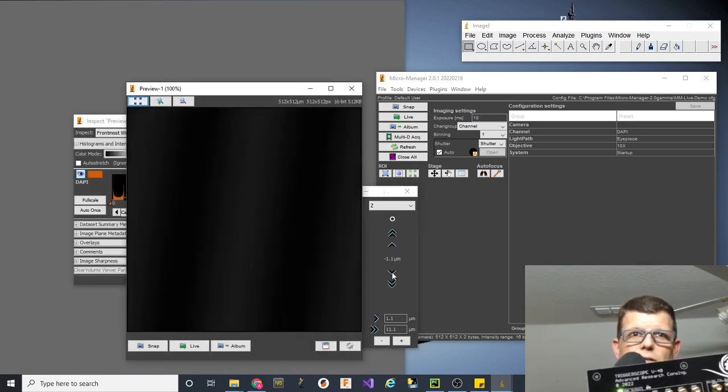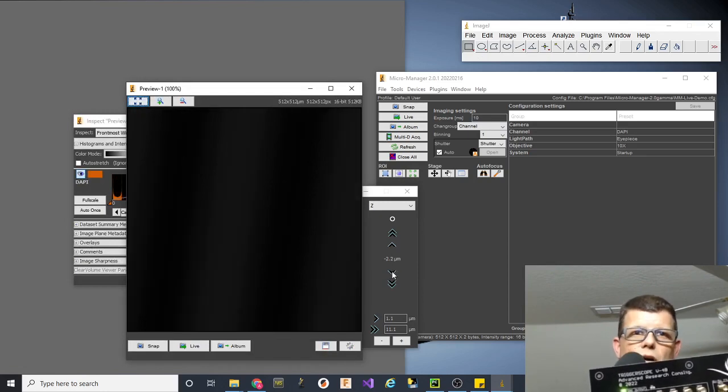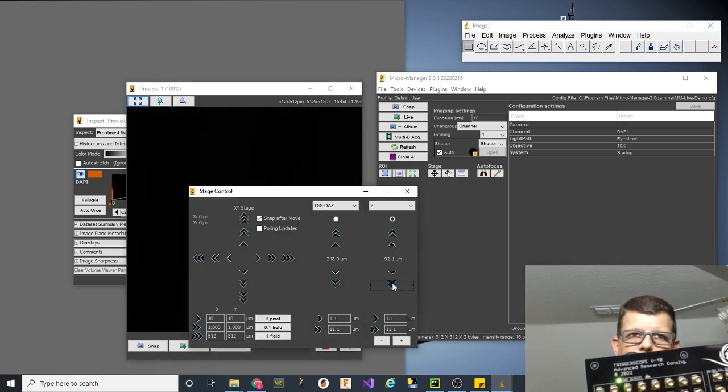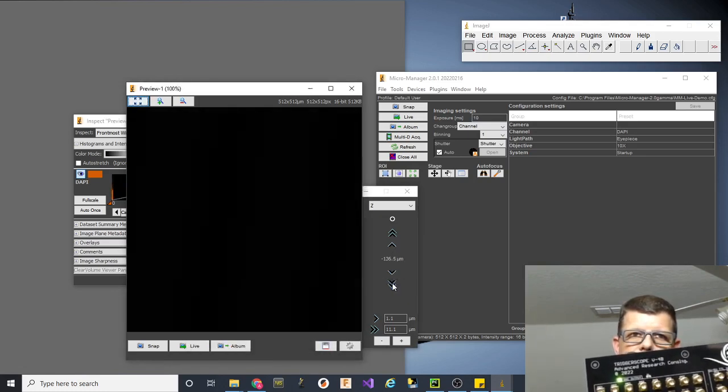Now if I come back down to 0, normally it will want to turn off. Let's see. Oh, it jumped a huge number, which is why. So if we come back to 250, it should turn the unit off. Let's see.